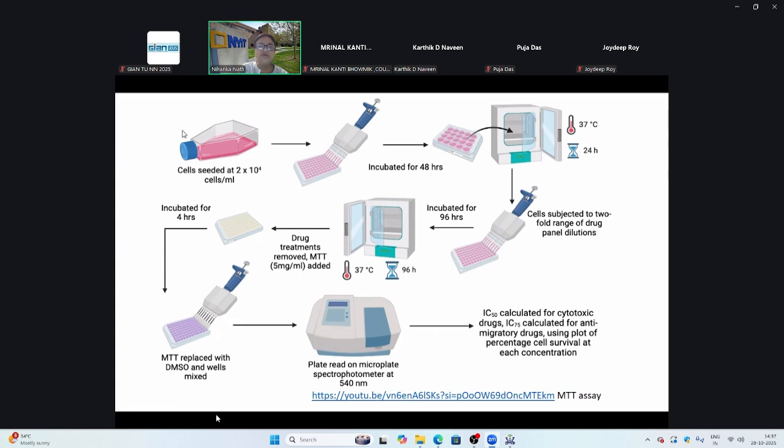In this summary, if you can see on the left-hand side, it's a tissue culture flask, not a plate. At the bottom are all the cells, and that is liquid medium. The cells in tissue culture are growing in this. This is not your specimen from a human being. It is cells that we store in the freezer, and the cells are growing here at the bottom. It's laid down like this.